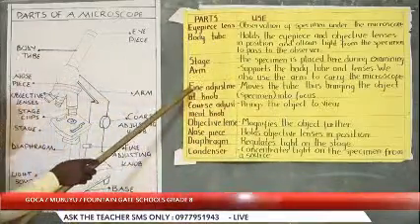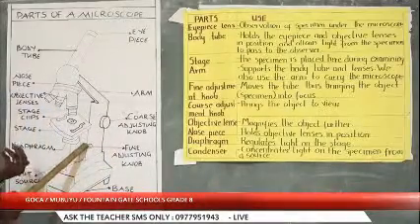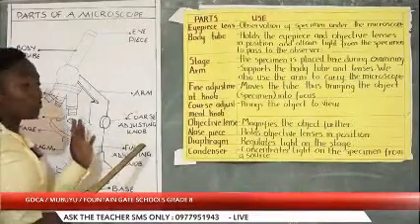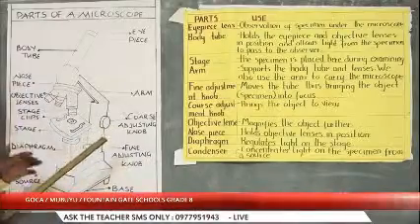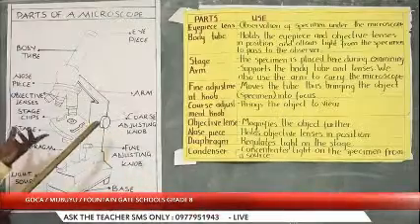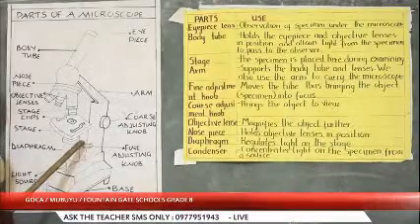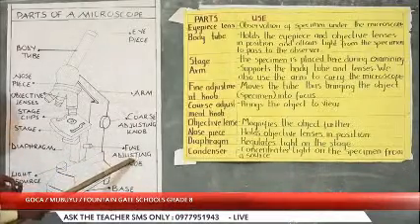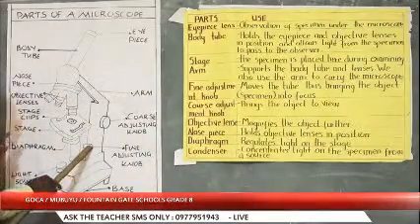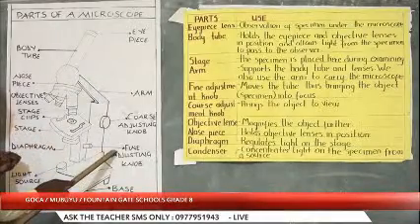So at least we know the function of the fine adjustment knob, which is just right here. Hope we're able to see, because in the exam they'll label different types of parts and tell you to explain the function of B, explain the function of C, and name the part labeled B. So those are the questions that they bring in the exam. So we should know where they are put exactly. The fine adjustment knob is just this small part here, and the function of this is that it brings the object into focus. It does what? It brings the object into focus.